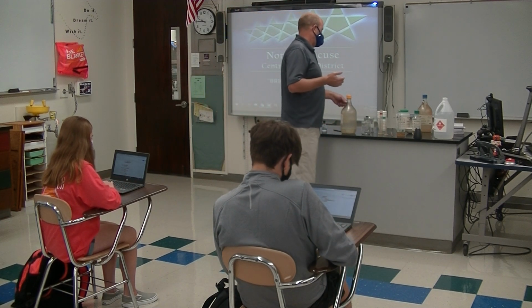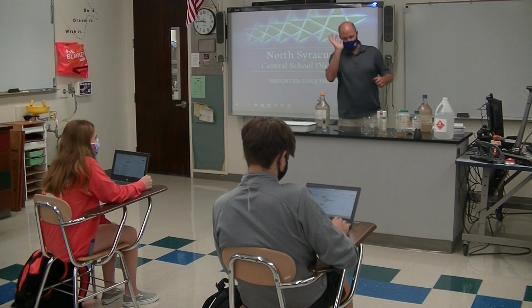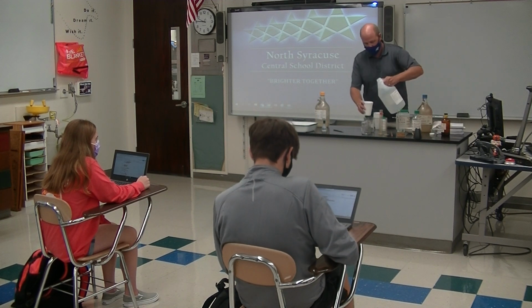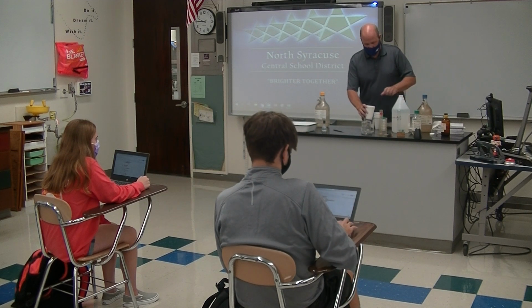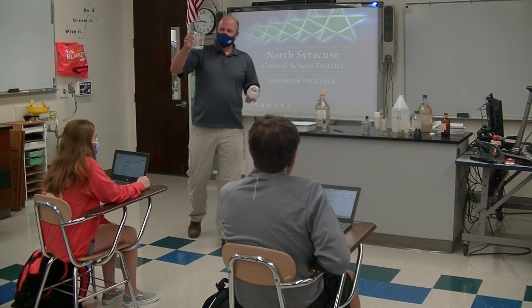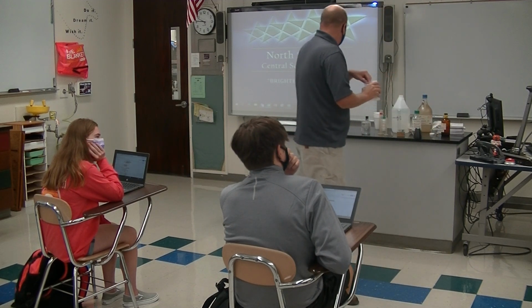So just like you guys are right now, I've been talking for a while. Some of you are paying attention, some of you may not be. You kind of half listen. You're like, oh yeah, I got it, whatever. And you come up and get this chemical, pour it into this cup right here, and start walking back to your seat. And what happened? Where'd the cup go? The chemical kind of ate through it.